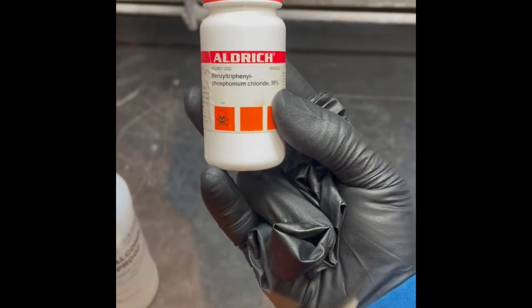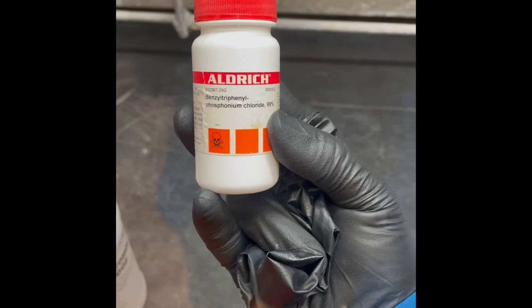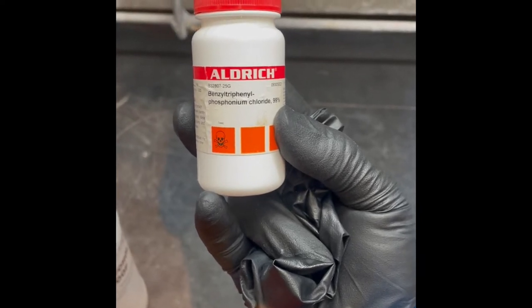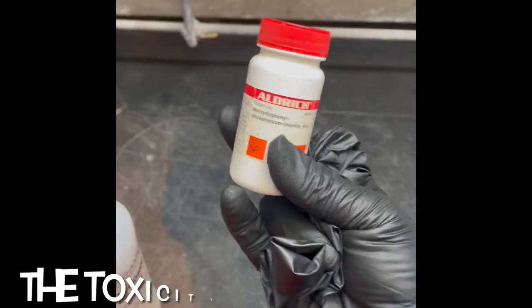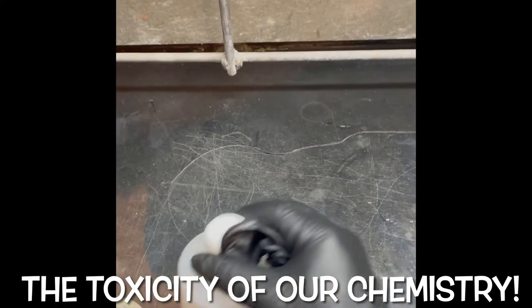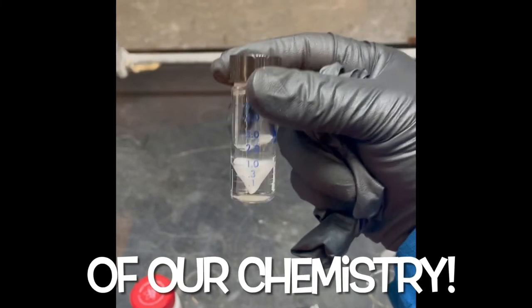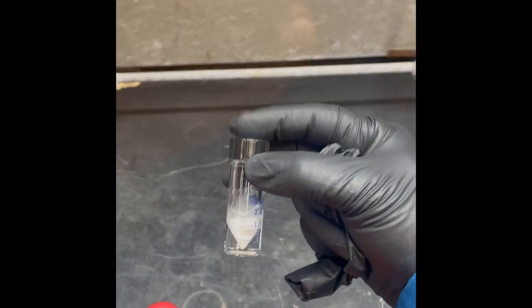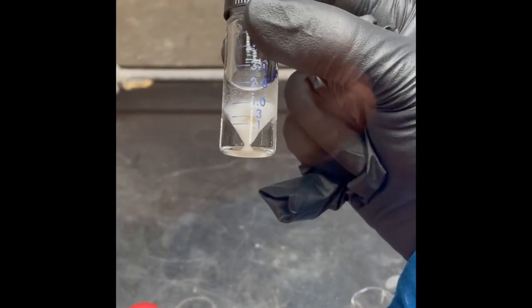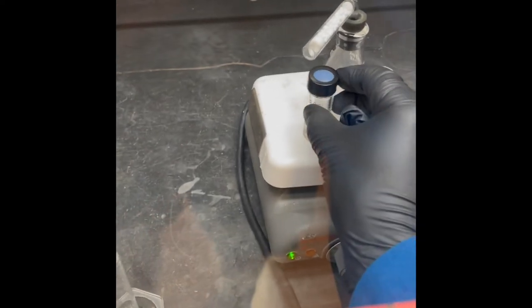All right, so I used 0.480 grams of benzyl triphenyl phosphonium chloride. Check out that skull right there. Mix that with 2 mL of ethanol inside of this dry, remember, I flame dried it, conical vial, and there is a spin vane in there, which you really can't see because it's covered.